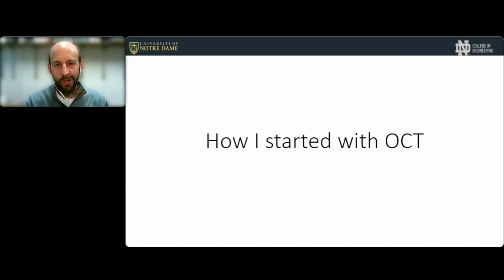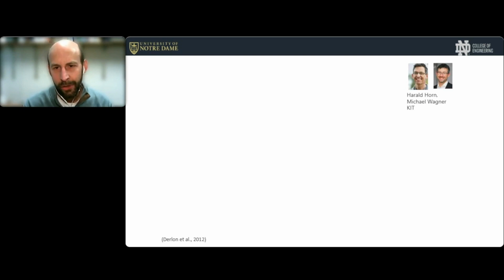Okay, so here's my story with OCT, how I got started with OCT. It turns out in Germany, a group of researchers at the Karlsruhe Institute of Technology, Harald Horn and Michael Wagner, I believe, were one of the first people to start using this technique for biofilm research, at least in the environmental field.